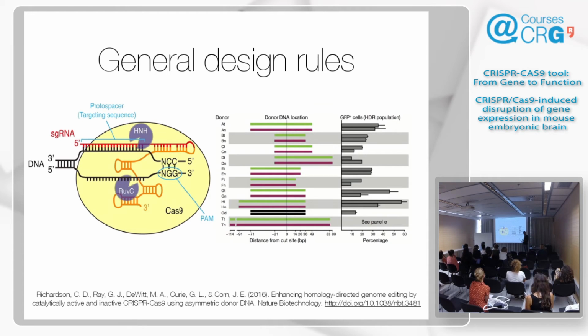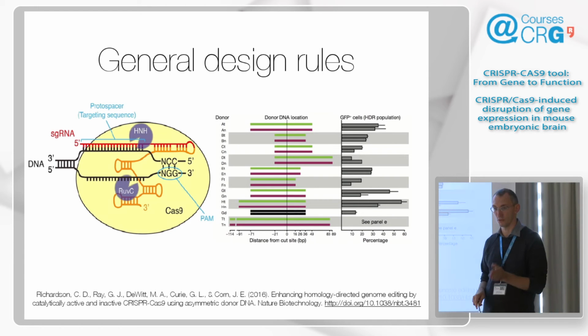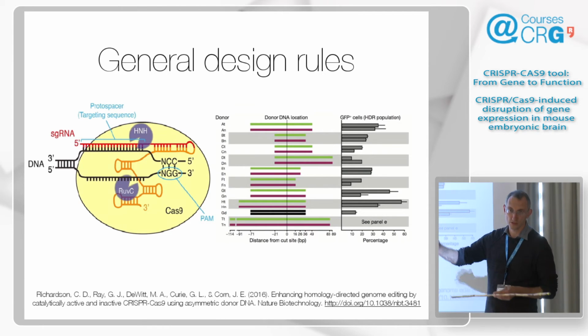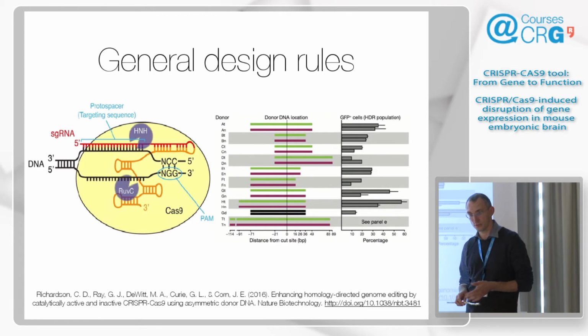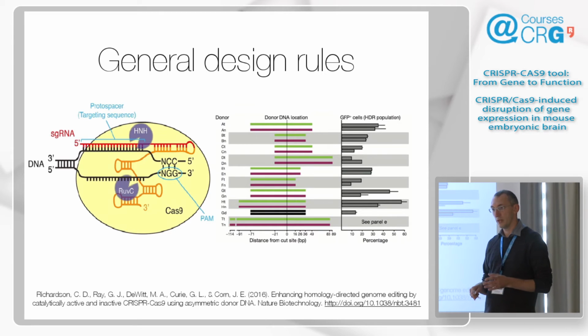I missed one point that's also important here. In the same paper, they actually showed that Cas9 persists on the lesion for a very long time. And this is something we also notice in vitro. When you cut, if you don't purify from the protein with PK, proteinase K, and then purification, you get smears, gel shifts, massive gel shifts. The protein is there. So they also notice in vivo, and they do single molecule experiments and so on. And basically, many hours later, they can still detect the protein, even after the cutting, right, with the nuclease. So it stays there, binds the two sides, on one side through the palm, on the other side through the guide, and persists on the position.